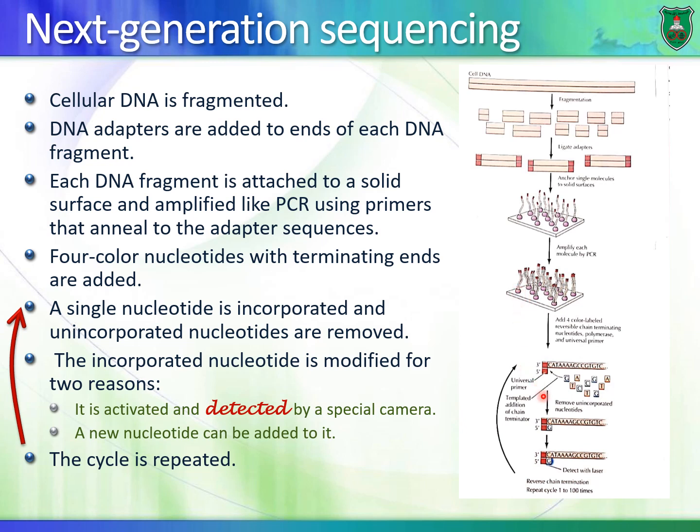Special nucleotides are added, okay? These nucleotides have two properties. One of them is that once one of them is added, the next one is not added unless the first nucleotide that is added is activated. It's modified so as to allow the second one to be added.